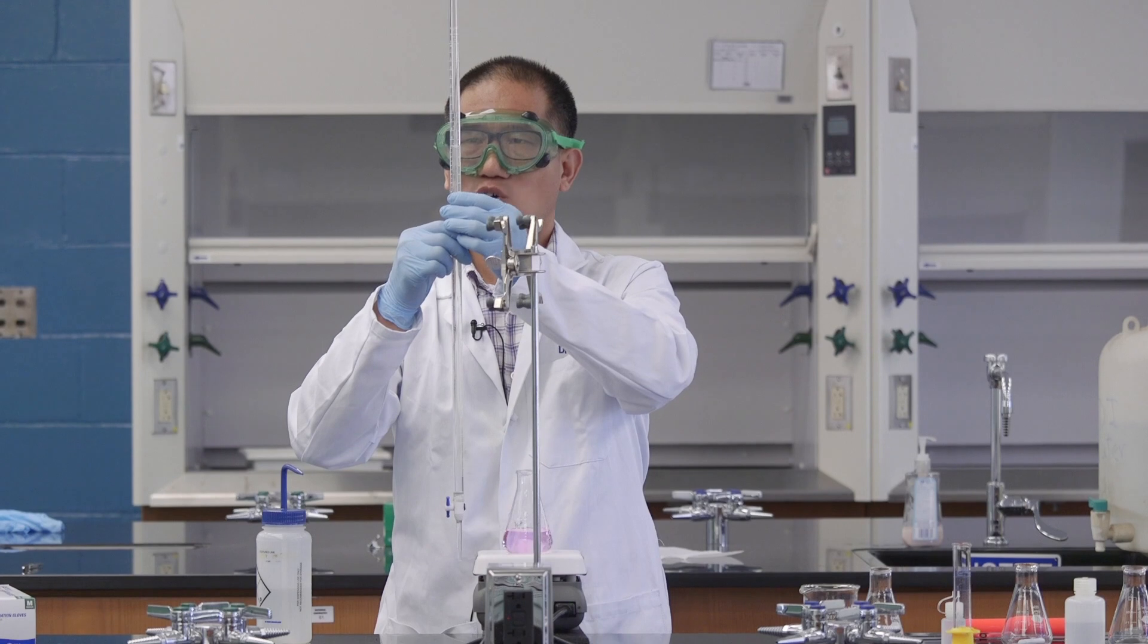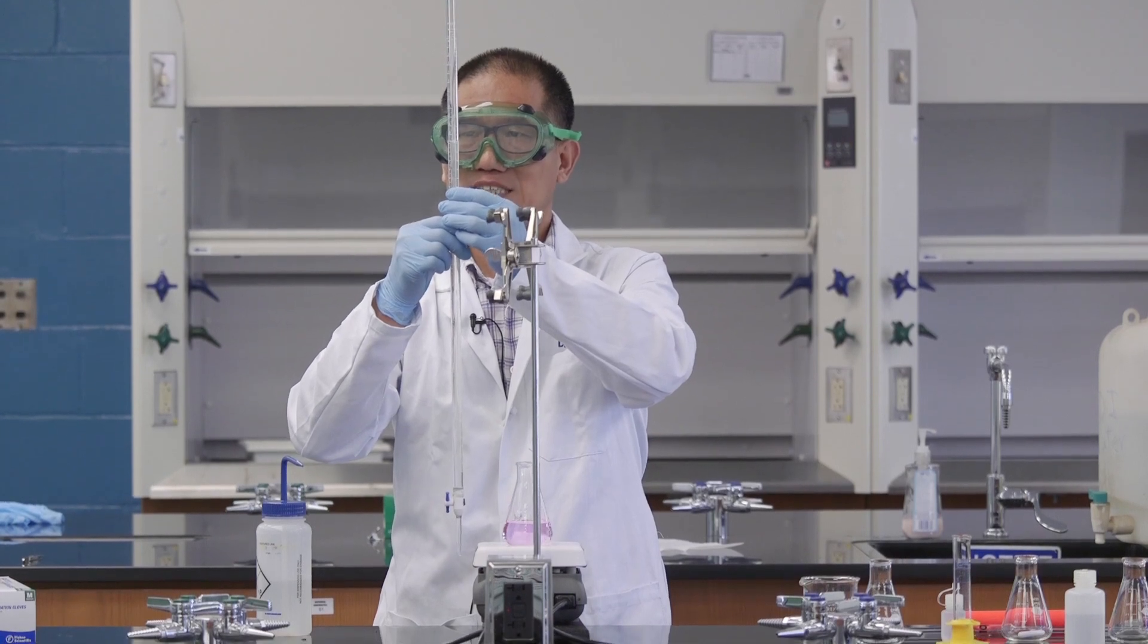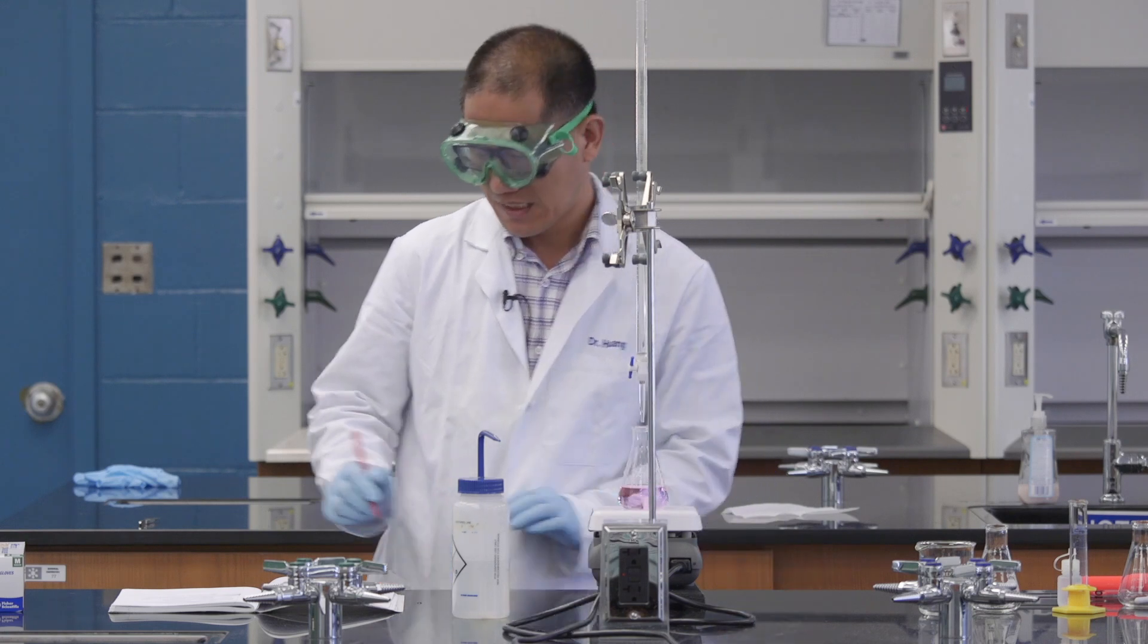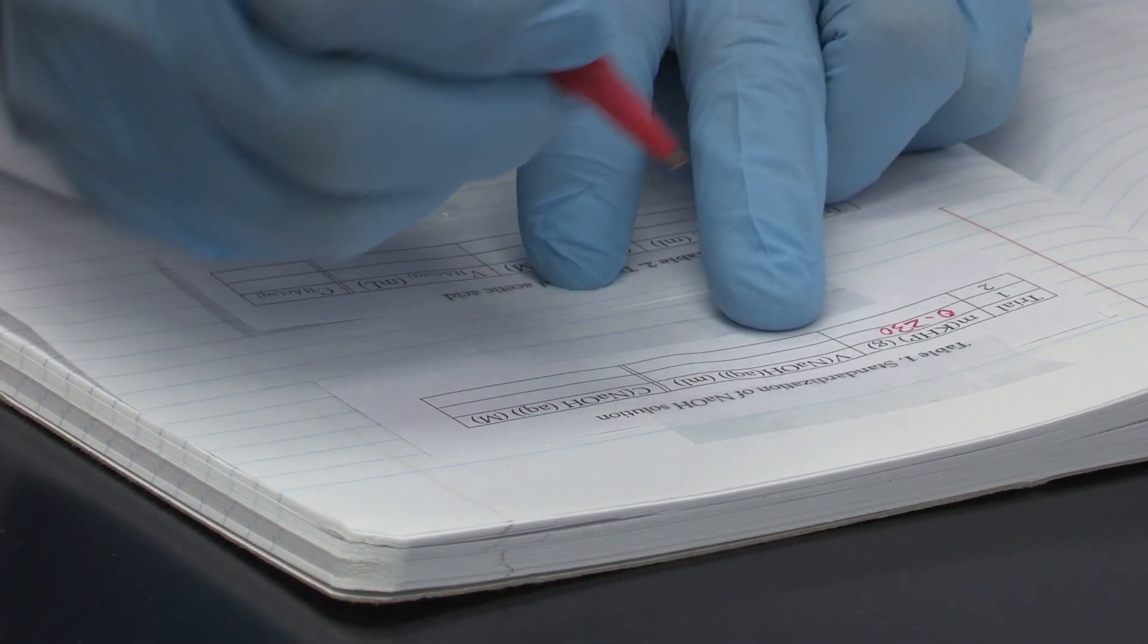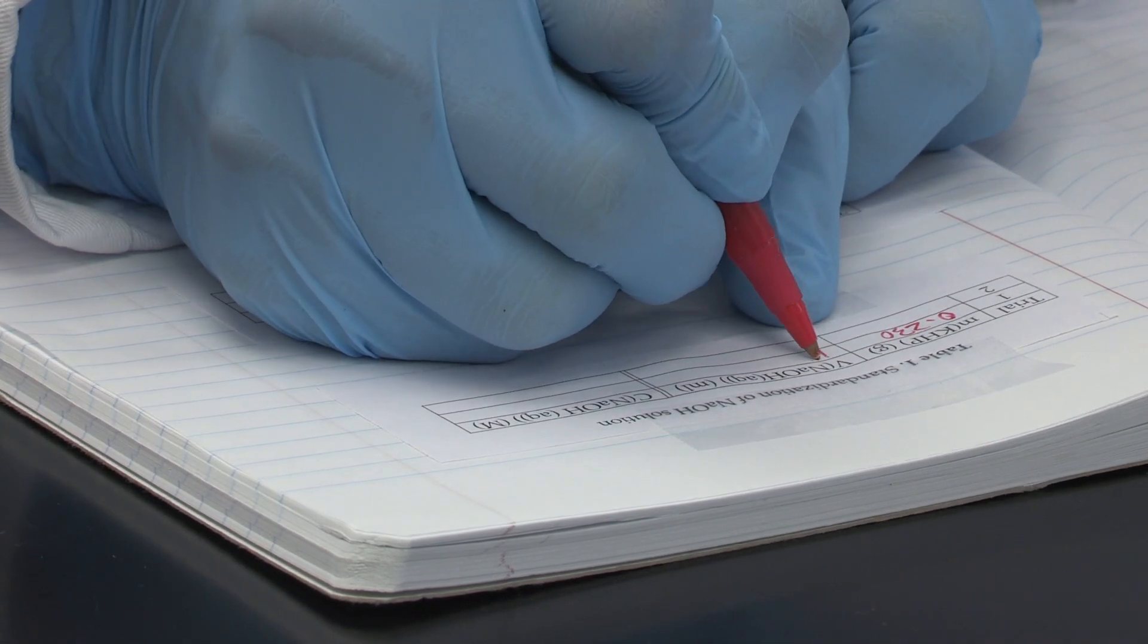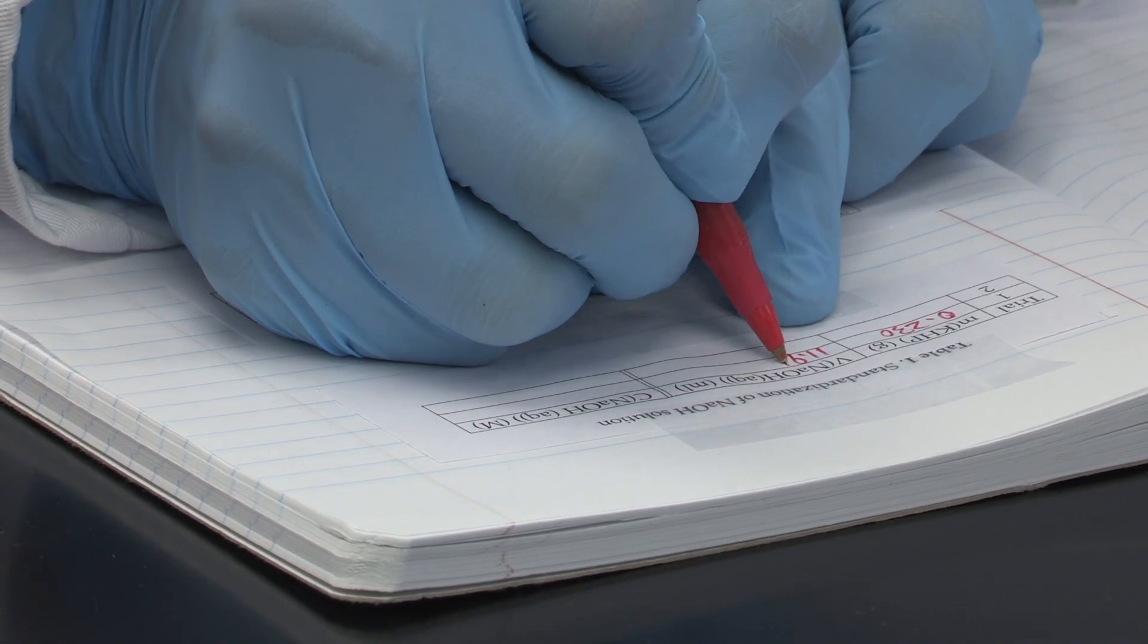Remember, you always need to estimate another digit. Let's record the data immediately. The volume of sodium hydroxide solution we use is 11.91.